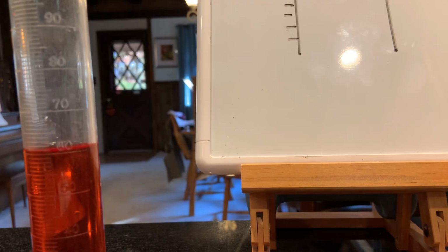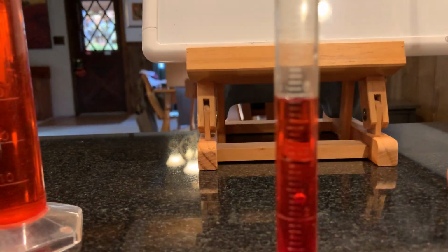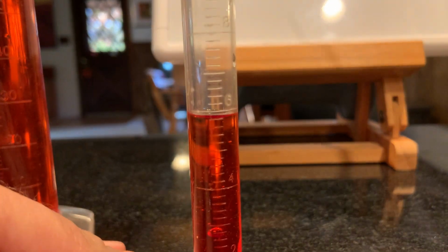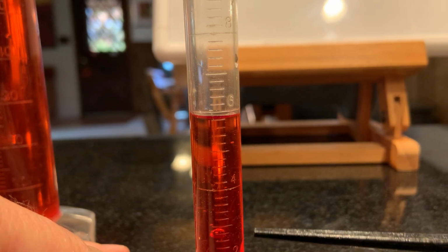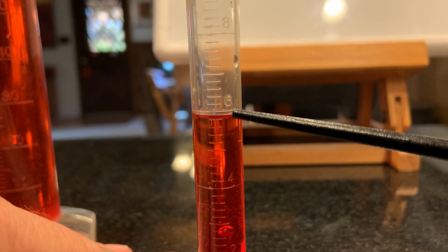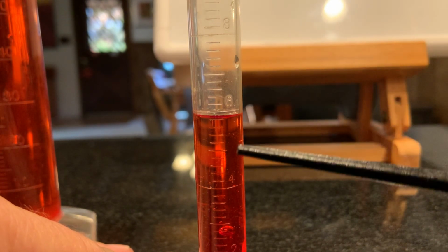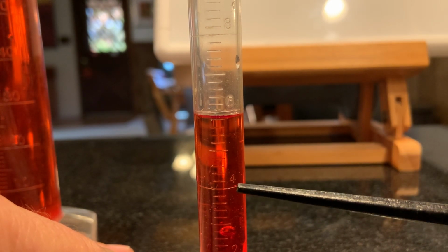I think the trickiest one that we work on is our smallest one. This is the one that seems to get the most kids. Okay, so let's get into focus. All right. So this one is labeled, we can see here it goes 2, 4, 6, and 8. So let's be careful on this one. We got to go from 4 to 6, and these have to be even.